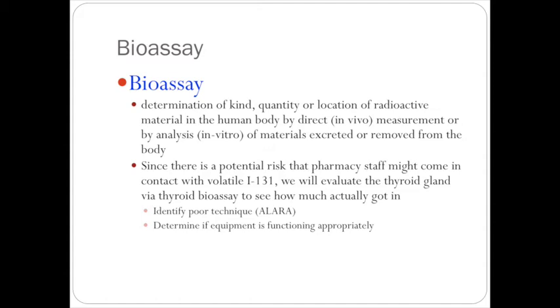So we could determine your iodine intake by collecting your urine and figuring out how much iodine was there. And if we can figure out what fraction of what was taken in is excreted in the urine, then we should be able to figure out how much ends up in your thyroid gland. You can imagine that's messy, it's awful, nobody wants to do it.